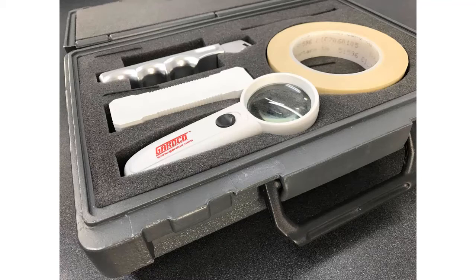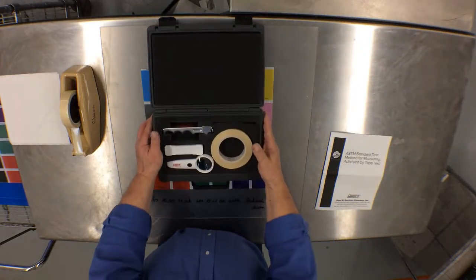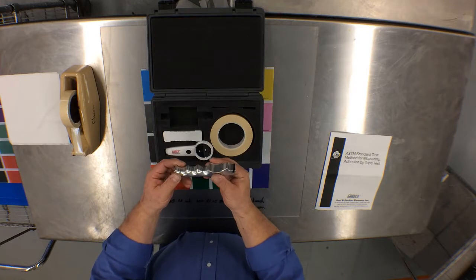The kit itself is referred to as the PAT kit, or paint adhesion testing kit. The Gardco kit comes in a sturdy plastic carrying case with handle. The kit includes a copy of the ASTM standard test method for measuring adhesion by tape test for use as an instructional guide, and a blade holder handle with guide.